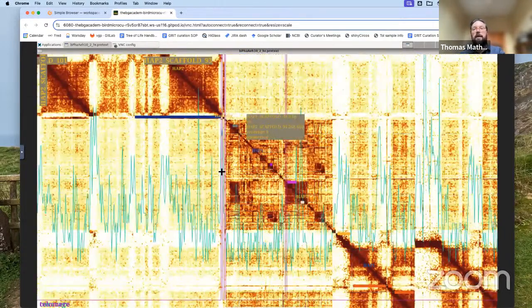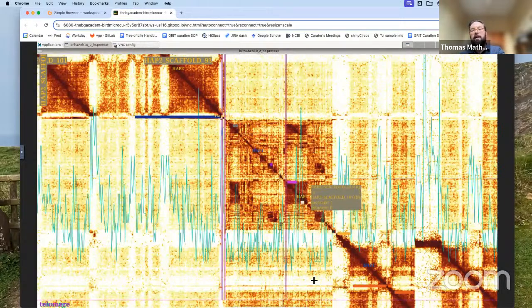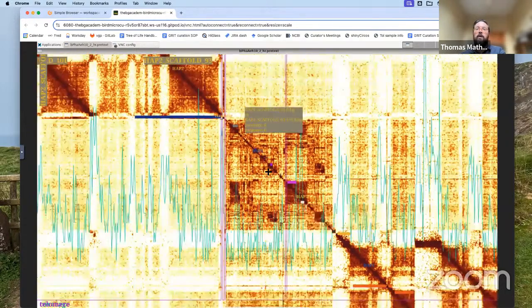What we would then do is take this as our first pass curation and output a new assembly file from pretext of each haplotype, regenerate a FASTA file for each haplotype, and then split out the small stuff from the big stuff. In the talk, I showed you this chromosome here, which is all this small stuff, which generally groups together, but we can't see exactly how it goes. We can't see a lot of detail at this resolution, but it looks like they all belong together.